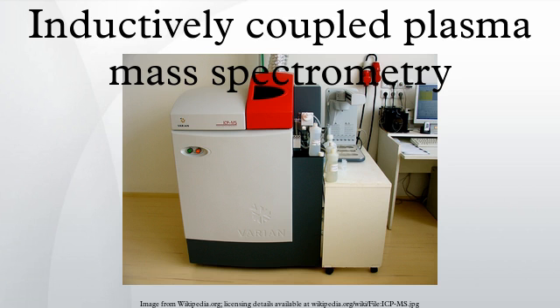Another primary use for this instrument lies in the environmental field. Such applications include water testing for municipalities or private individuals, all the way to soil, water and other material analysis for industrial purposes. In recent years, industrial and biological monitoring has presented another major need for metal analysis via ICP-MS.